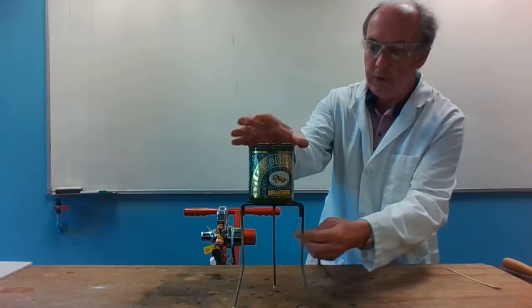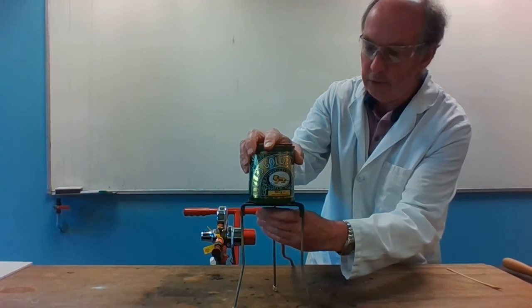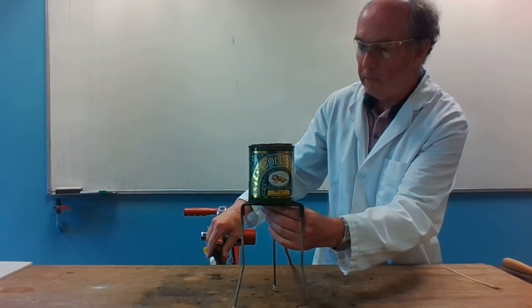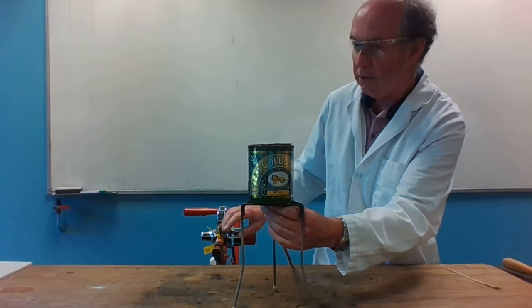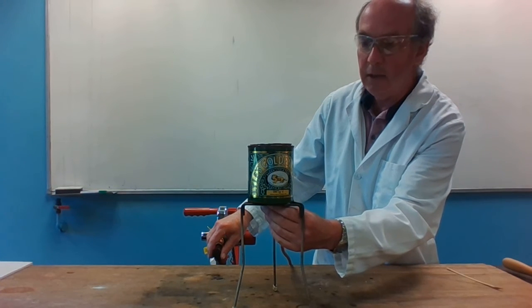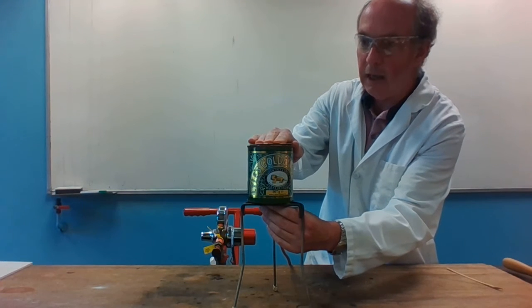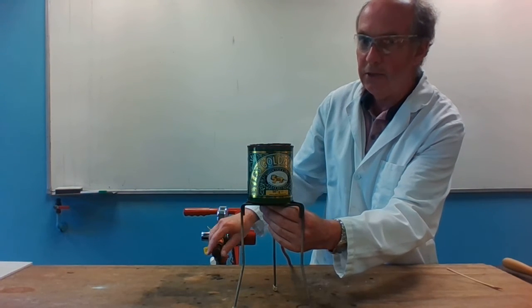I'm going to fill the tin up with hydrogen gas from the gas cylinder and then ignite the gas that comes out of the top of the tin. I want to make sure that it's full of hydrogen gas, that there's no air in there to start with.